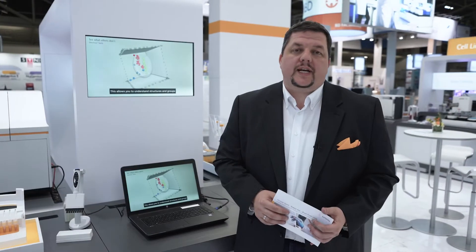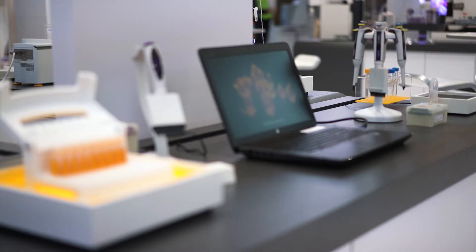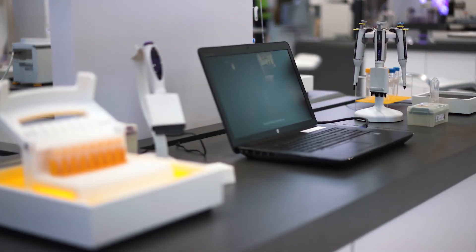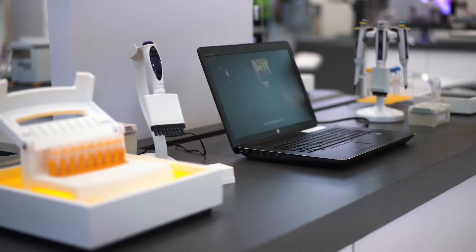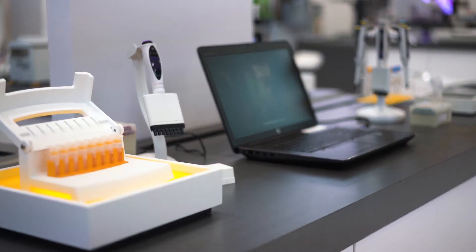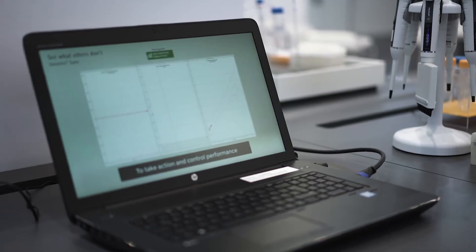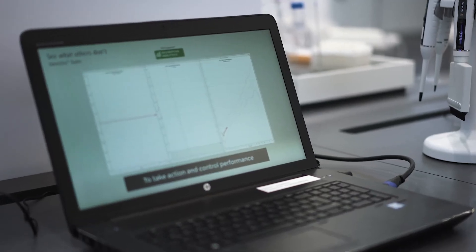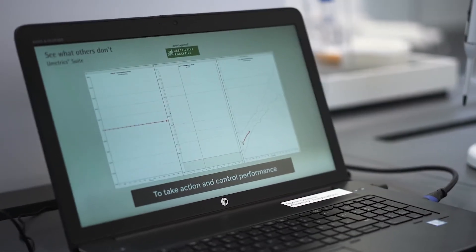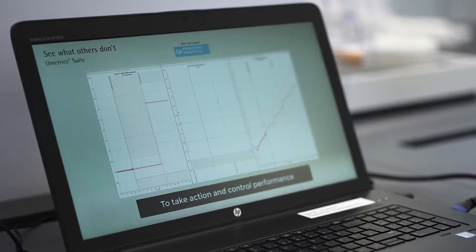Here we are at the next station of the molecule development island. We are showing the Eumetic Suite software, Simca, which is very useful for optimizing your processes either on lab scale or production.